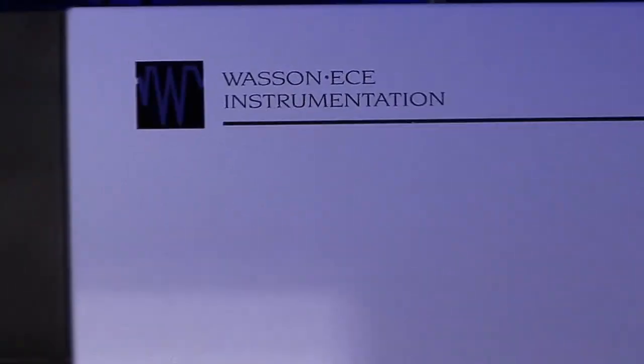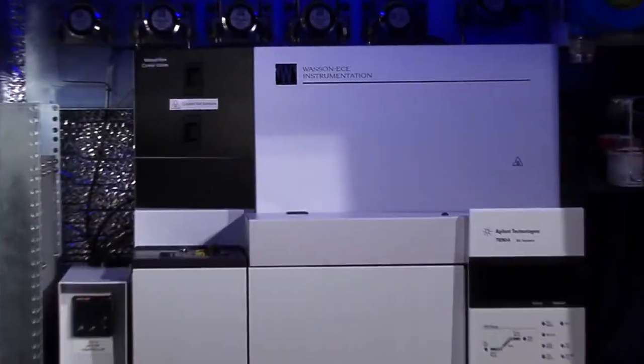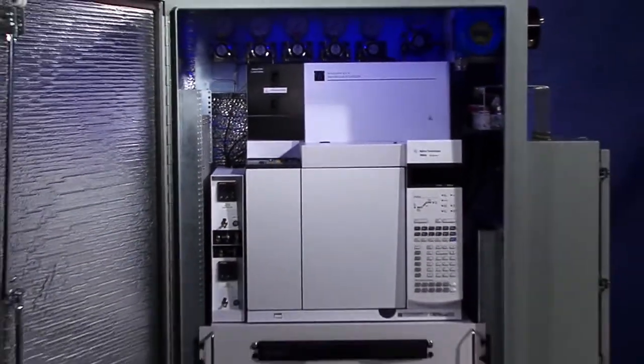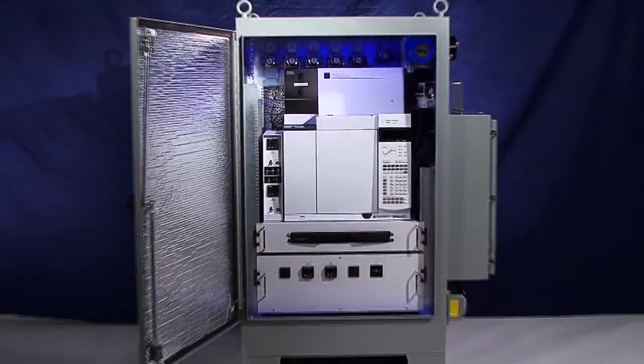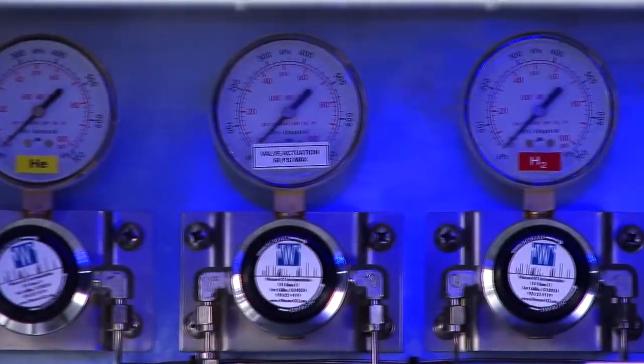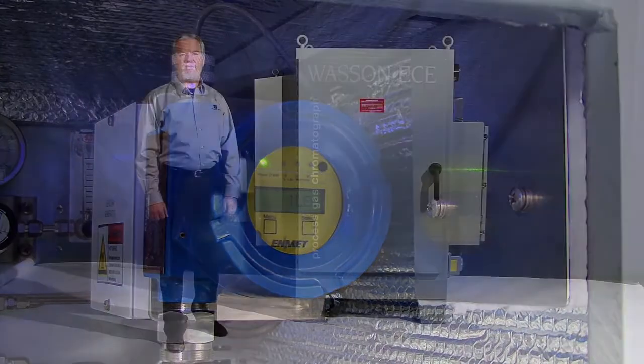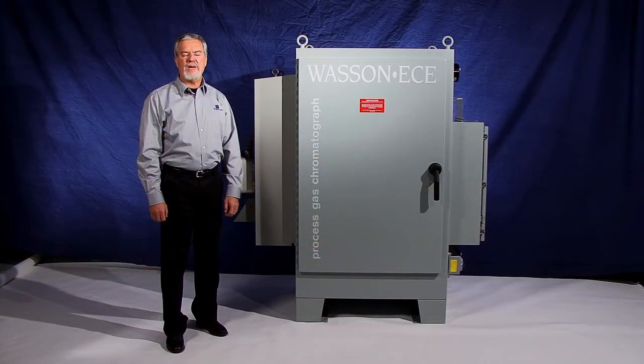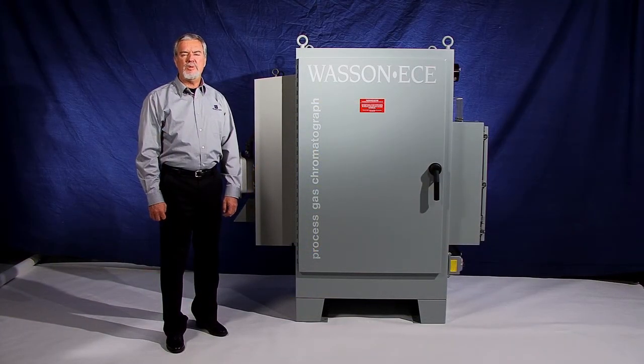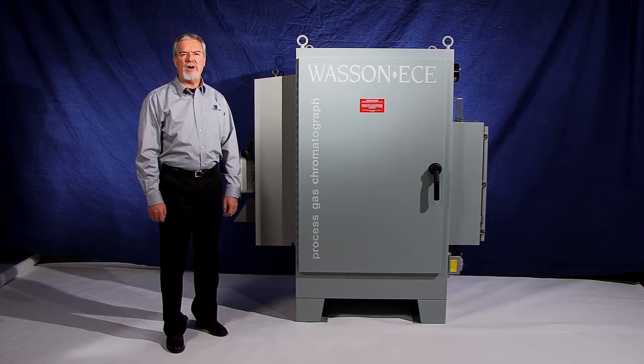As a process gas chromatograph, it is ruggedized and fully automated for deployment in chemical plants, refineries, and environmental monitoring stations. It is purged, pressurized, heated and air-conditioned, and meets NFPA 496, Class 1, Division 2, Groups B, C, and D hazardous area requirements.